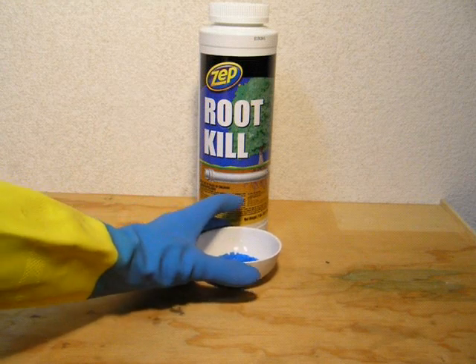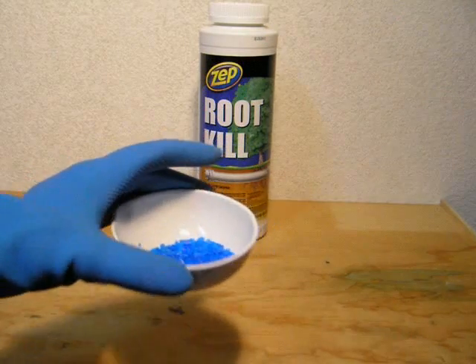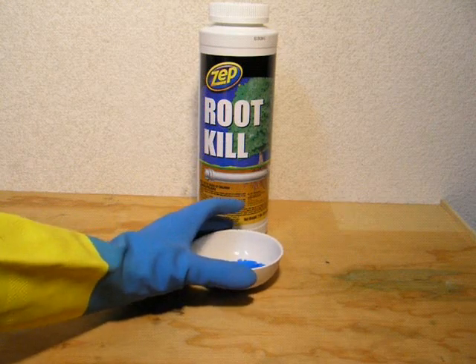Alright then, let's get started. Obtain 15 grams of copper sulfate pentahydrate. This is sold as Root Killer and is recognizable by its blue crystals.